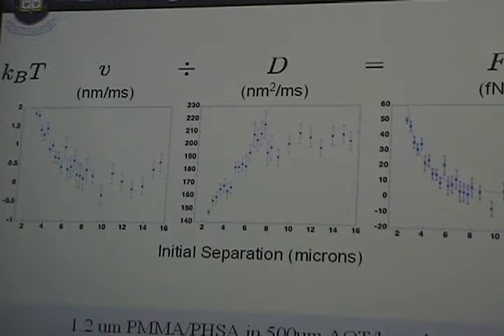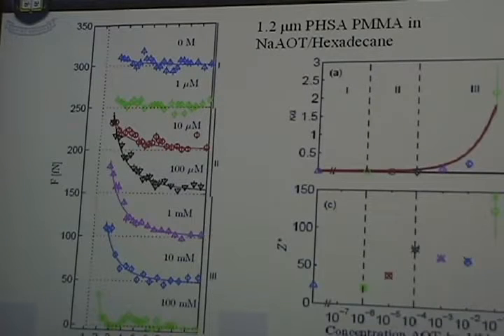Okay, so it's a very simple point here, that just by looking at the kinematics, all the dynamics comes out of the temperature. And we can calibrate things with a thermometer. So what do we use this for in our lab? One of the things we use it for is to understand the electrostatic interactions of colloidal particles, and I don't have time to tell you about how any of that works. But I'm just going to show you some example data.